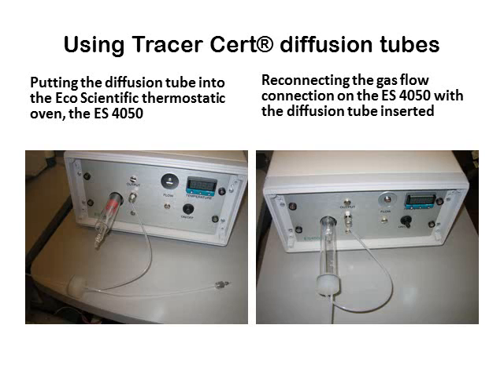In the right-hand photograph, with the diffusion tube placed in the thermostat oven glass compartment and its sealing cap back in position, you will see two plastic tubes through the sealing cap. One goes right to the other end of the glass compartment and is for the input of the carrier gas, and the other is for the output of carrier gas, now with the added trace vapour.